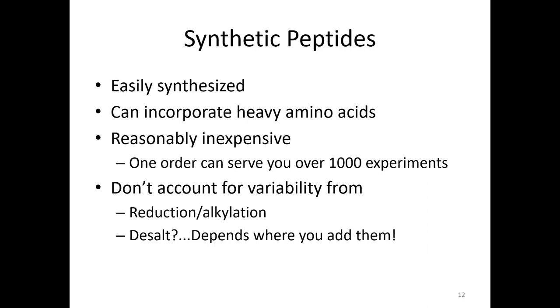However, at least the ones that we've worked with, if they contain a cysteine residue, we ask that they're synthesized with the alkylation intact. And so they wouldn't account for reduction alkylation, obviously not digestion, and so on.